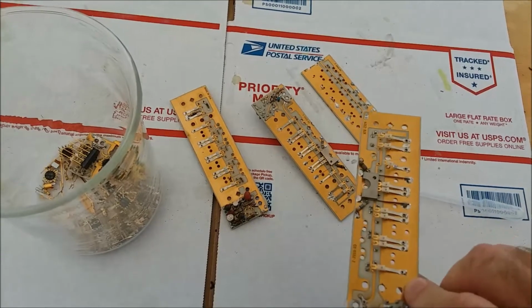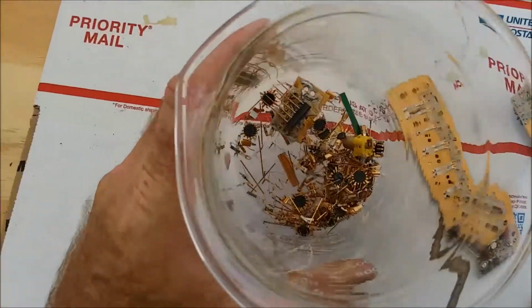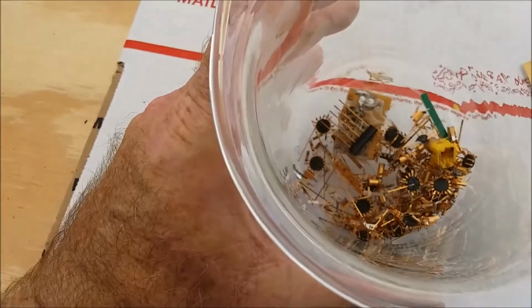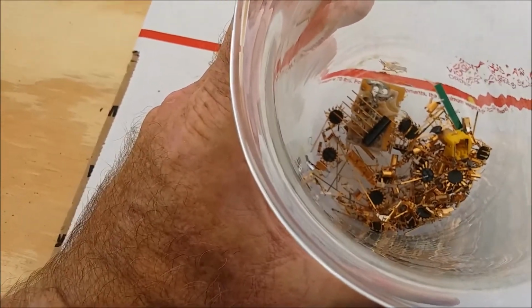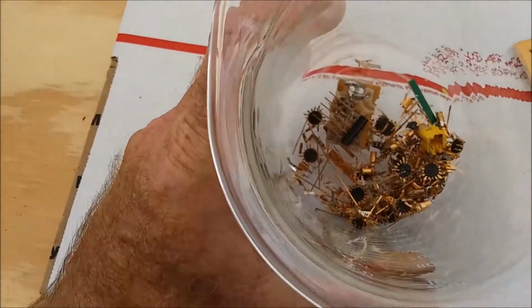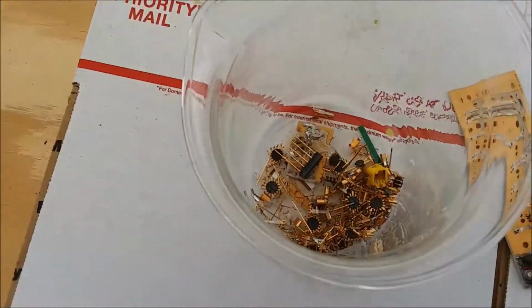So what I'm going to try and do is recover the gold from these. He also gave me all of this stuff down here in the beaker. So, it looks like gold-plated legs on ICs. There's some connectors. There's some pins. There's some fingers. There's all kinds of stuff. But there's a lot of base metals in all this stuff.